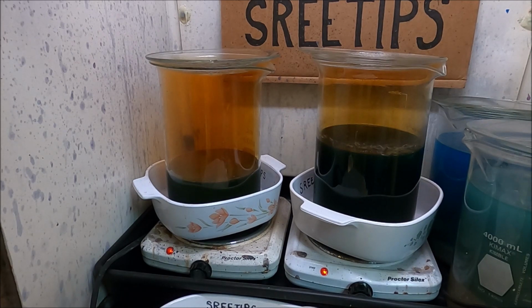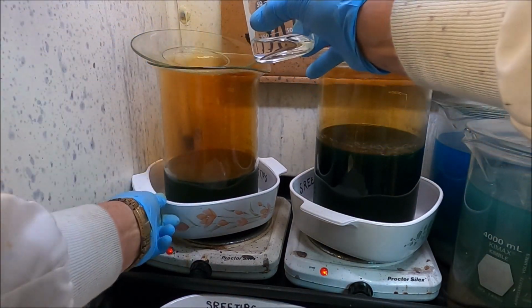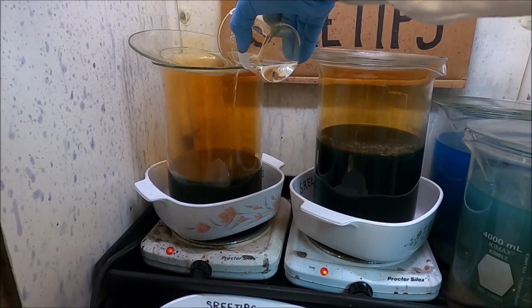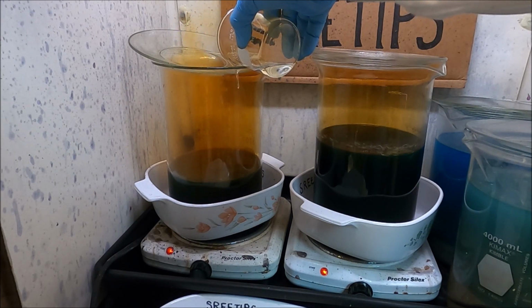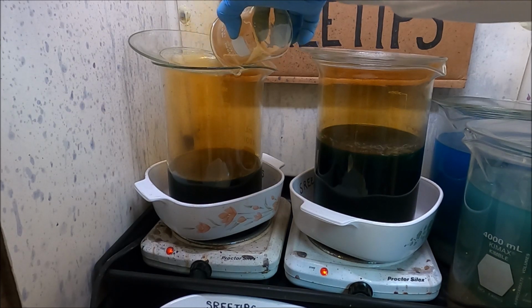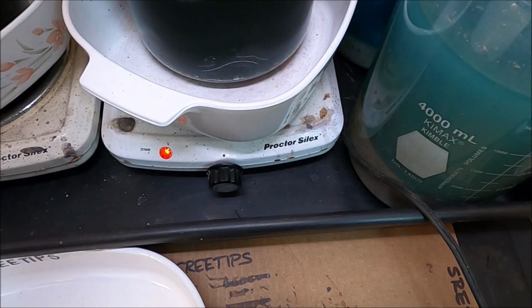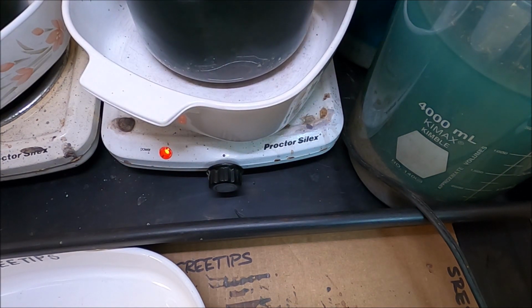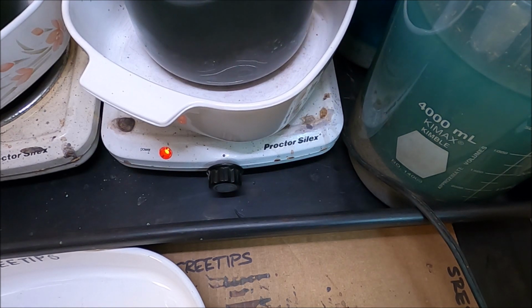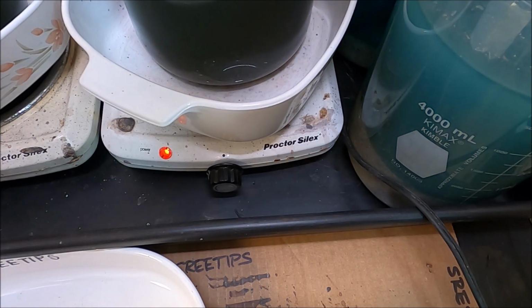Been about 2 or 3 minutes since I added that last dose of our dilute nitric acid. Try to get the rest of this in there now. All these solids in it. There's still quite a bit of solid material in there. As you can see, I can see some pieces of silver, and I'm just going to let this react. I'm not going to add any more acid to this beaker until we get all this acid consumed.